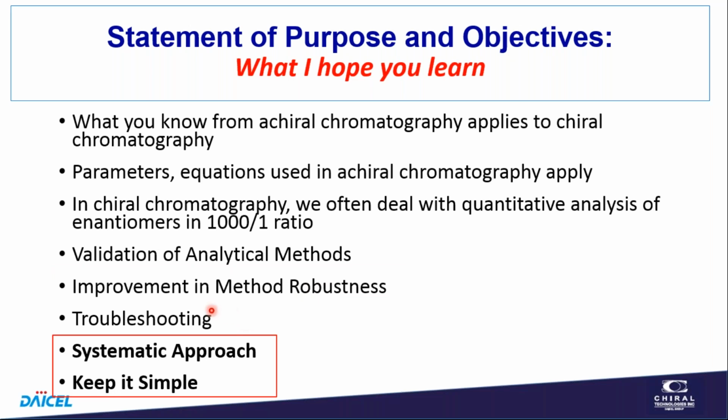I like to use a systematic approach to method development or to troubleshooting, and so I think I'm going to show you some examples of that. I think what happens is it's a little bit front-end loaded. You do a few more experiments on the front end, but the advantage is you get much better understanding in the long run. Do probably fewer experiments, and it gets you to an optimum or to a good position fairly quickly. It also lets you know how you got there, so you know what parameters are important and maybe what are not.